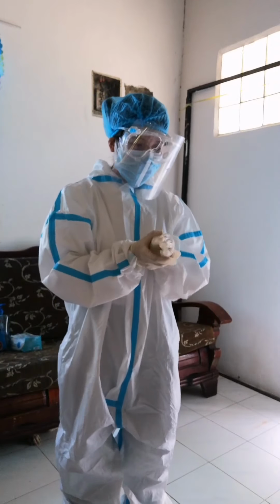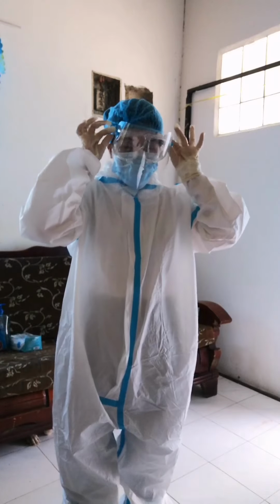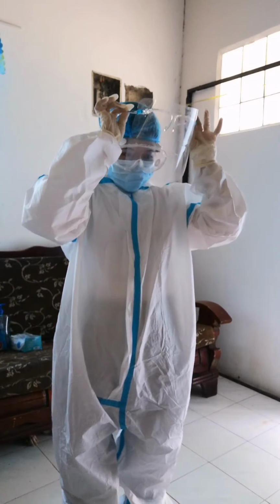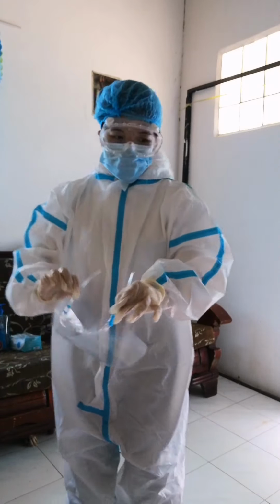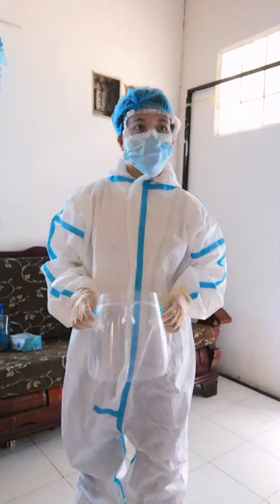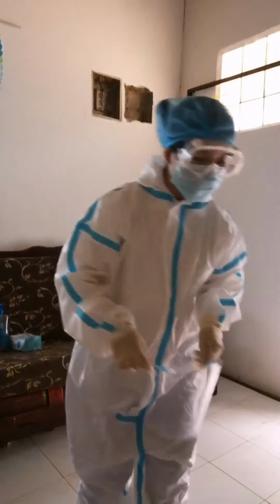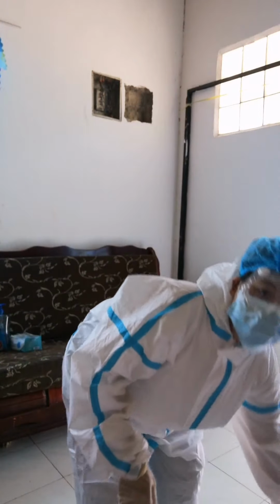Next is to doff the face shield. So we must touch the sides of the face shield. This is mainly because the sides have lesser exposure when facing a patient.